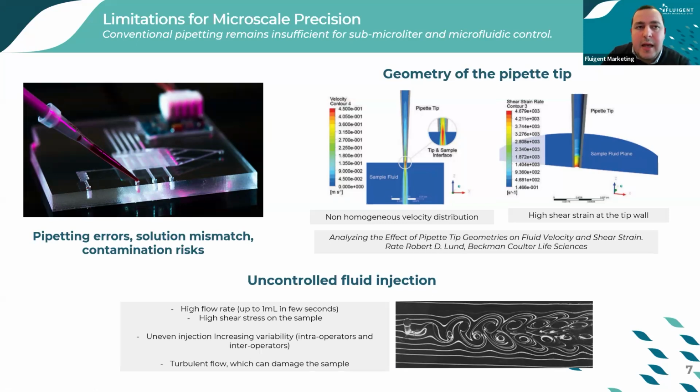And in this case, you will have high flow rates, high shear stress, and uneven injections, which can lead to sample damage and errors from intra-operator and inter-operator variability.